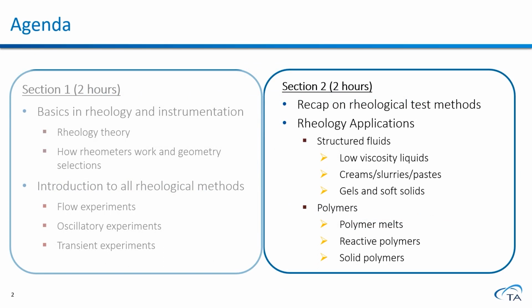Here is the agenda for what we will be covering today. First of all, we would like to have a recap on all of the available rheological test methods, which include flow test to measure viscosities and oscillatory test to measure viscoelasticities. And then we're going to discuss rheological applications to varieties of different kinds of materials.